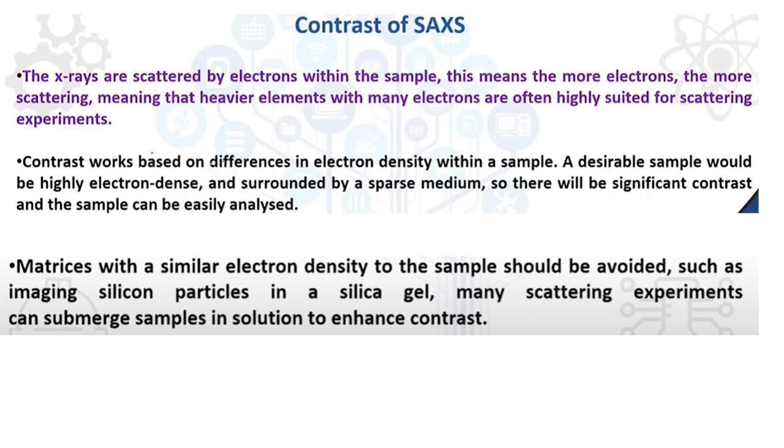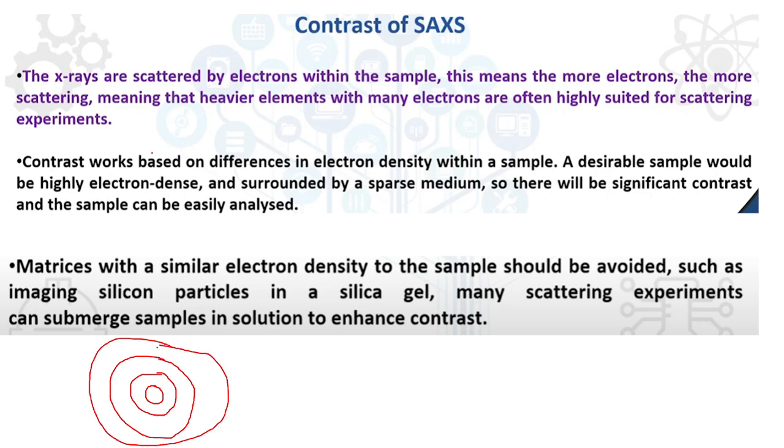First of all, how X-ray is actually generated, I have discussed in the first slide. For example, say this is the nucleus. There is the first shell, second shell, third shell, like that. Now X-ray generation depends on how heavy the metal is. Now why is a heavy metal required? Obviously a heavy metal means the effective nuclear charge, or number of protons, will be higher in the nucleus.